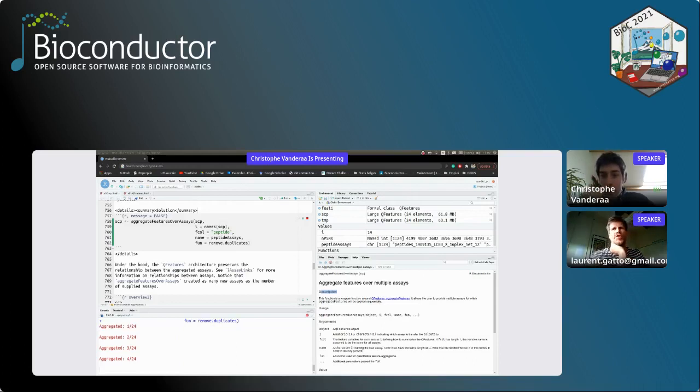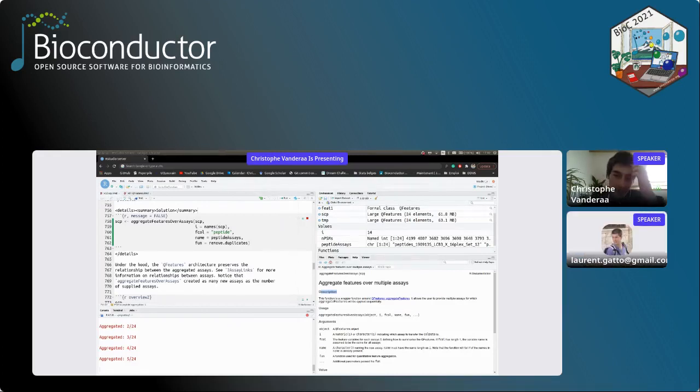The last one was a general question about SCoPE2. Unless I'm mistaken, we can expect a substantial increase of aggregation speed. Indeed, to go a bit technical, there is something happening in S4Vectors when replacing an element in the list object. If you look into those functions, you'll see there are some checks that are probably not required and that take quite a long time.